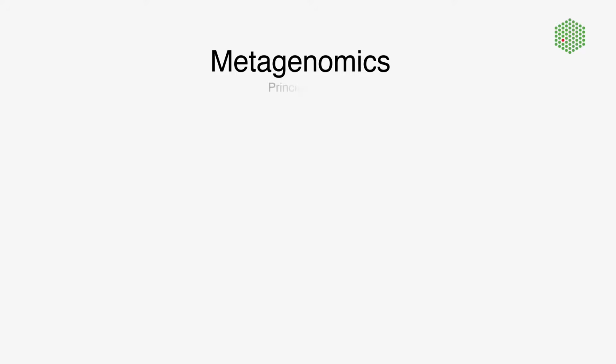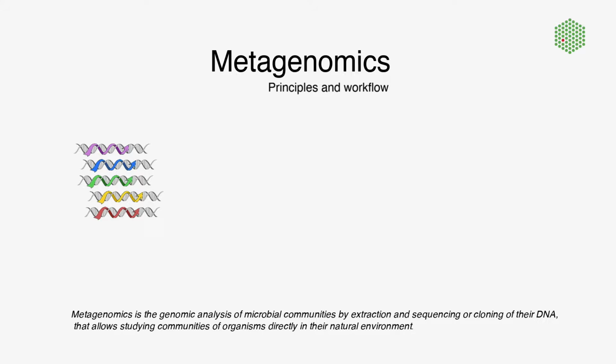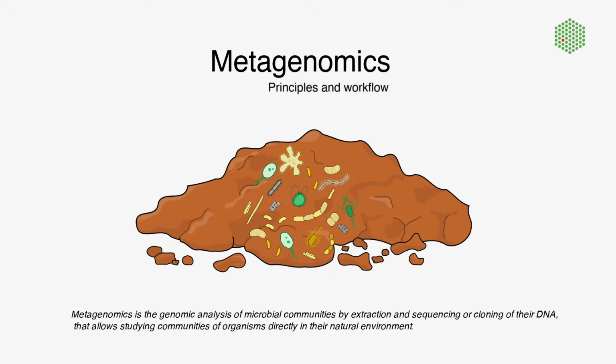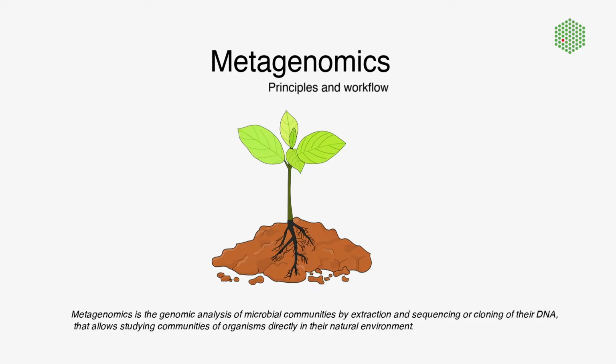Metagenomics: Principles and Workflow. Metagenomics is the genomic analysis of microbial communities by direct extraction and sequencing or cloning of their DNA that allows studying communities of organisms directly in their natural environment.